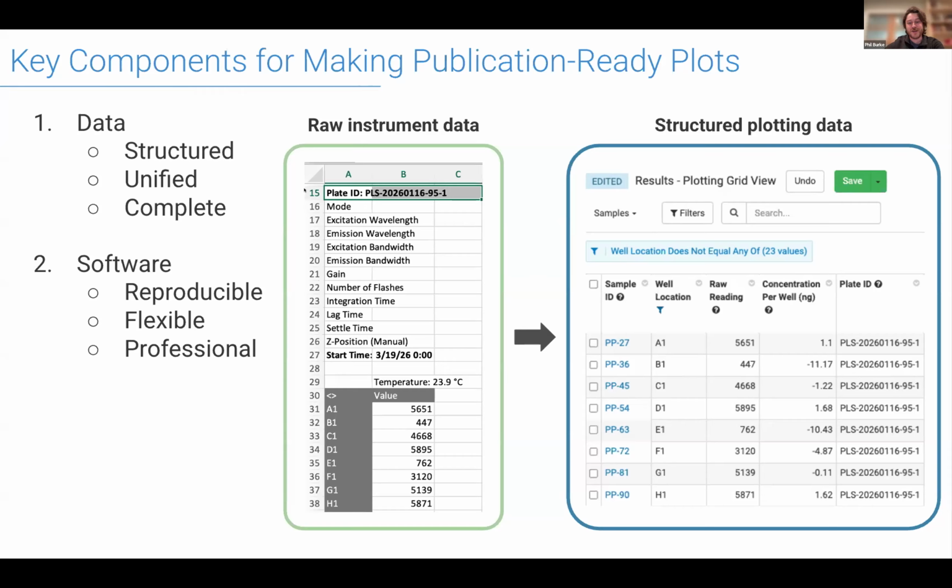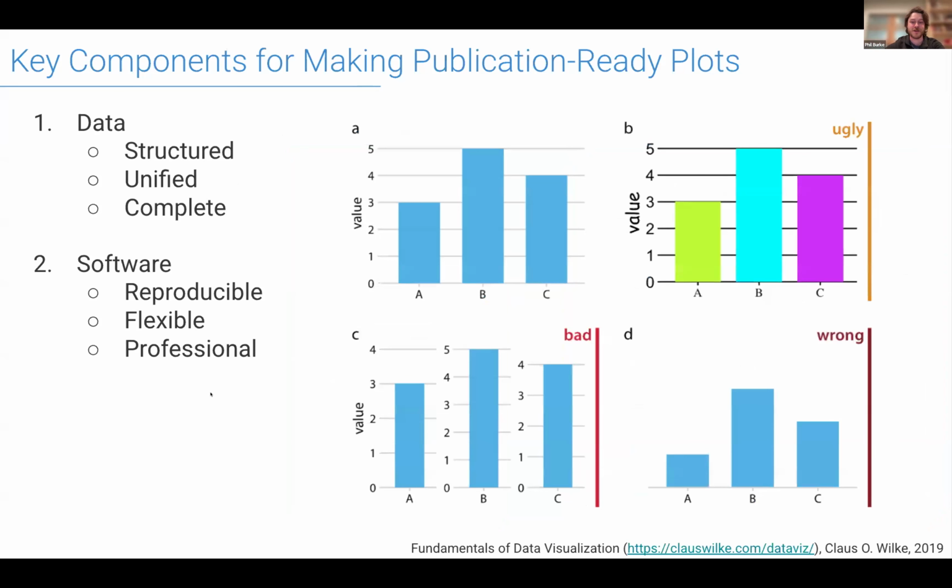So of course, this is basically what you're using LabKey for, to keep your data structured and managed and unified. So I'm not going to dig into this too much, just to say that it's nice to leverage your structured data to be able to quickly make beautiful plots. And also do some of the cool AI things that Origin is working on. So lots there. The other part of making plots that I think is pretty important is the software.